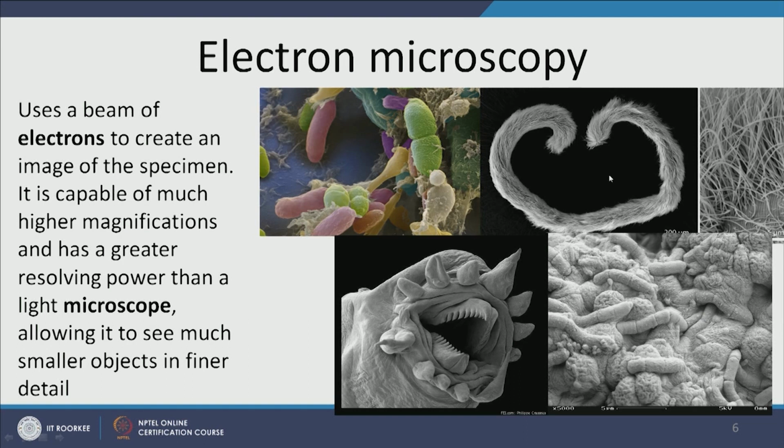Let's look at the top right first, these filamentous organisms here, and you can note that they are very small. It's not very clear here, but each of these is nanoscale in thickness, so they are nano-sized in diameter. We could not have captured this by bright field microscopy or light microscopy. It would have been difficult to capture by DIC. We would have got a fuzzy image by confocal scanning laser microscopy, but lo and behold, electron microscopy gives us a very, very beautiful picture.